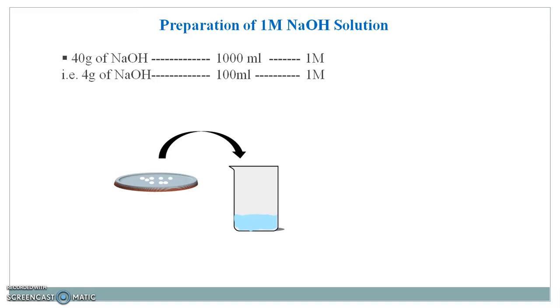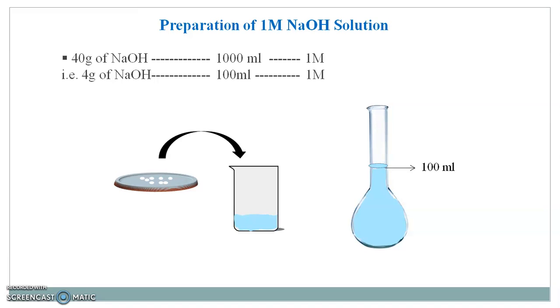Now, transfer the formed solution into a volumetric flask and make the volume up to 100 ml with carbon dioxide free water. This formed solution has a concentration of 1 molar — this is how you prepare a 1 molar sodium hydroxide solution.